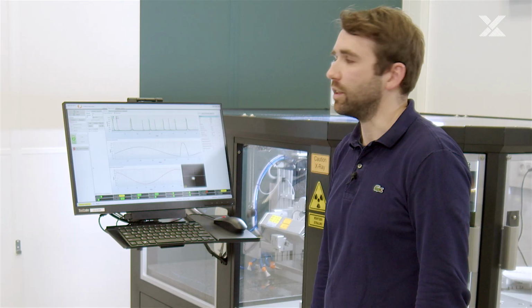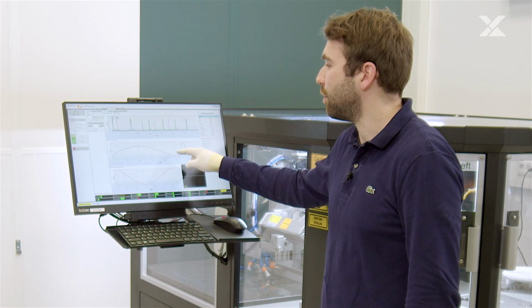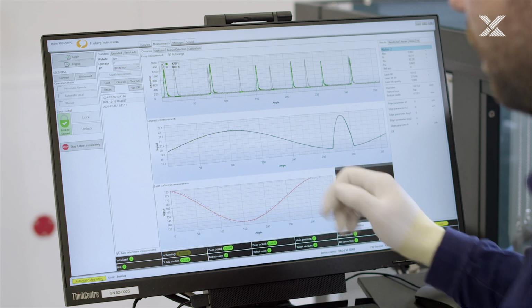In this case, we are dealing with flats, so by mathematical processing of the shape of such a feature, we can calculate important parameters of the feature, as I mentioned before, the flat width and the flat depth. The third one shows the laser correction curve, which is used, as we can see, by fitting this curve, to understand what the tilt of the wafer is as a reflective surface.